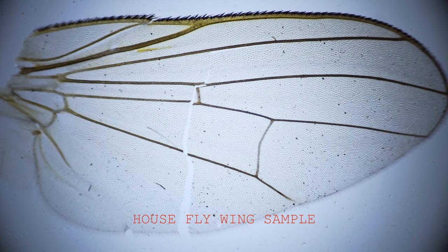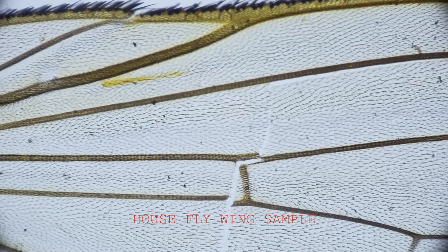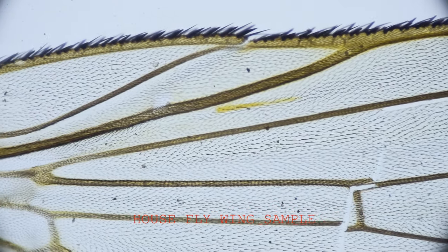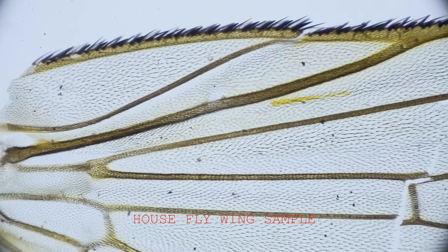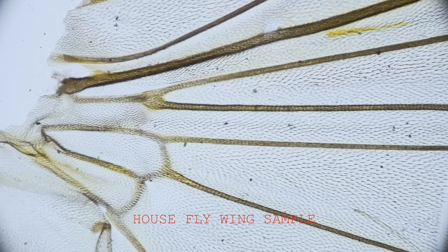You could see all like the little hairs on the wing. This is what it looks like when you magnify it a little bit more. Bam. Pretty cool, right? Let's move it around. You can see that's like the little housefly wing.